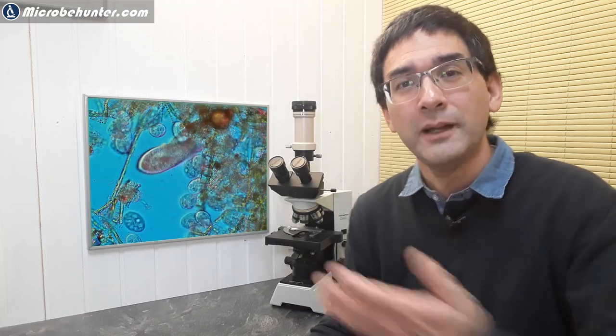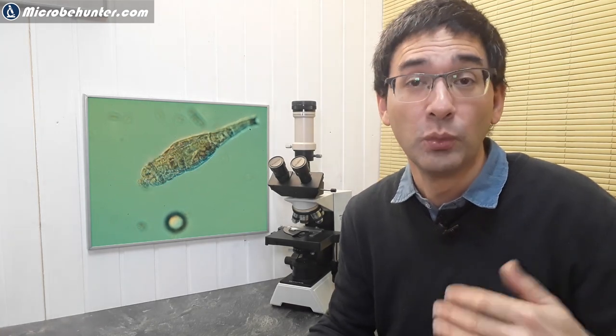So I don't really see a benefit of going nine megapixel microscope cameras. The microscope is not able to provide more resolution anyway, so all you're getting is larger images that don't show you more clarity.